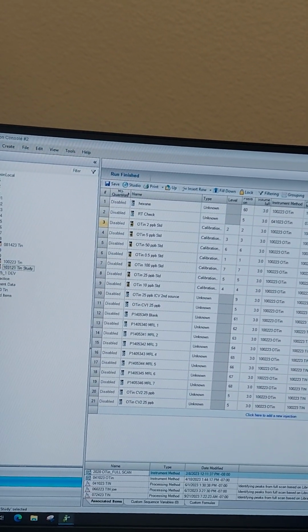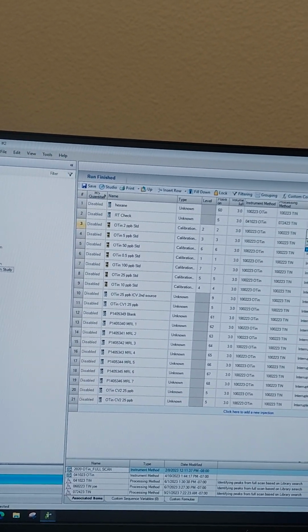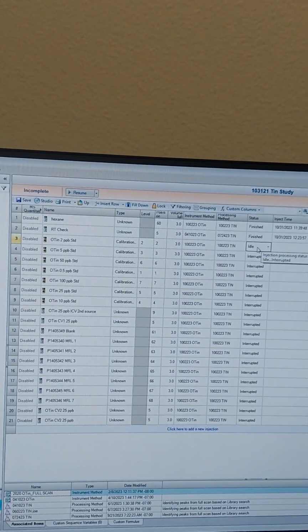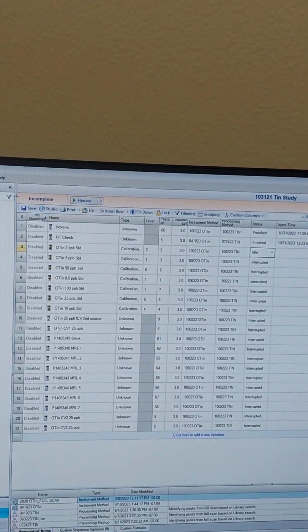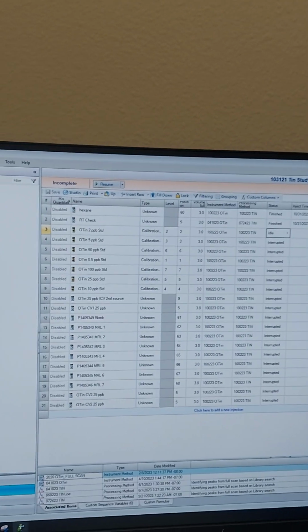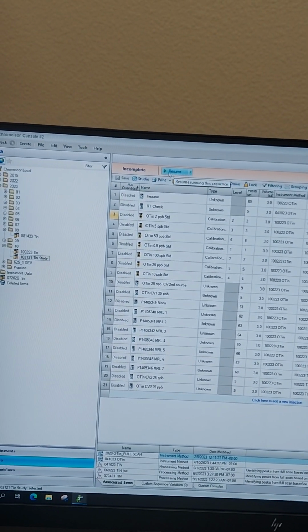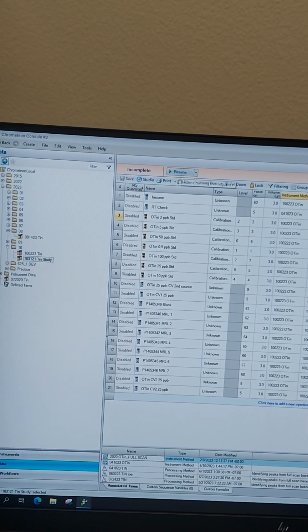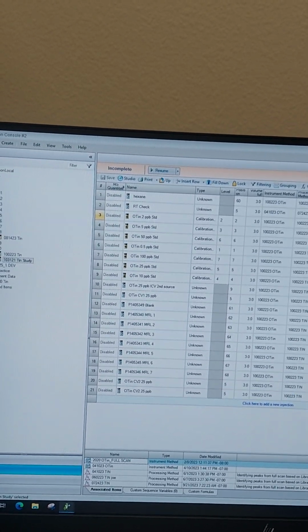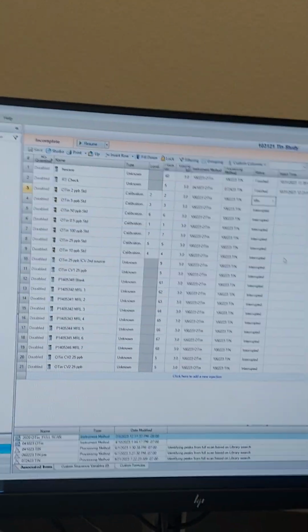Okay. So interrupted is pause. If we want it to be ready to go, ideal is idle, so it's waiting. And every time before you run it, make sure you save. Okay. So this is the resume button. If I press this, anything with idle will run. Uninterrupted done, it'll pause.